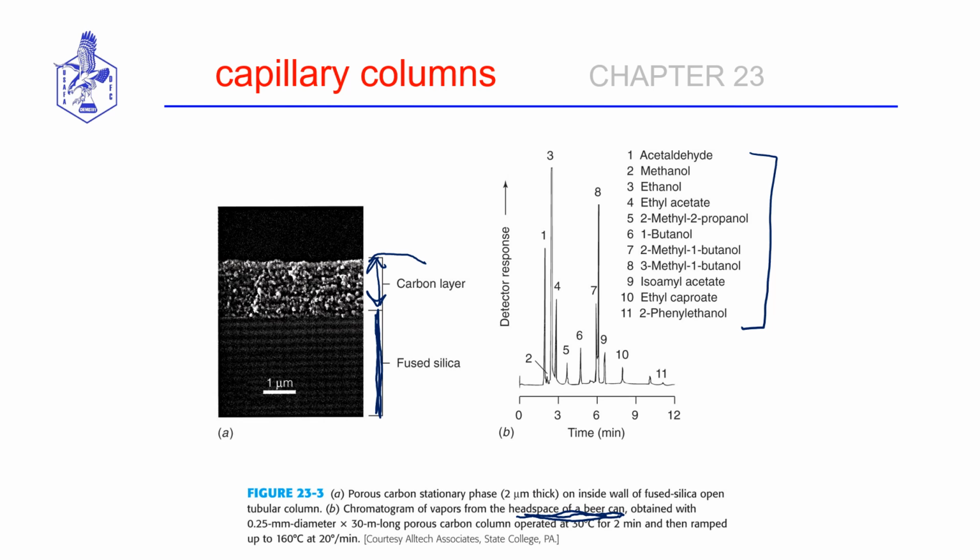And so you can see that when we do gas chromatography, we get clean separations, we get good resolution. I don't know if you remember shapes of peaks, but look at how sharp our little peaks are. They're very narrow in width, and that's why if you can do GC, it's preferred to HPLC, because we traditionally get better resolution and the method is just simpler to carry out.